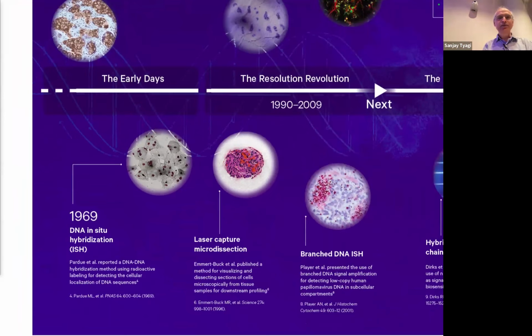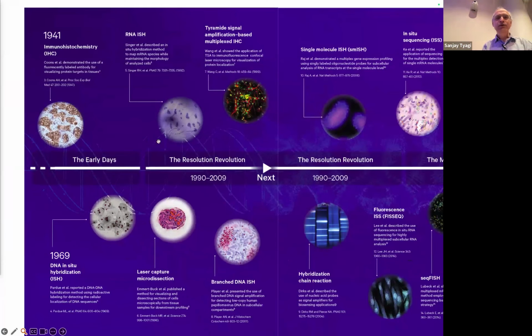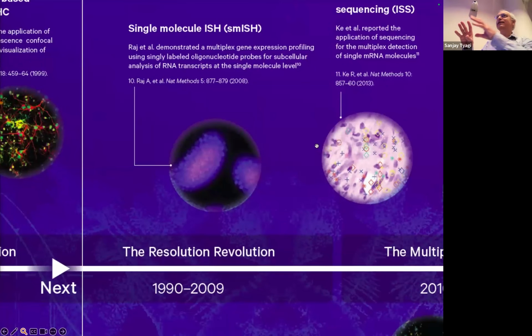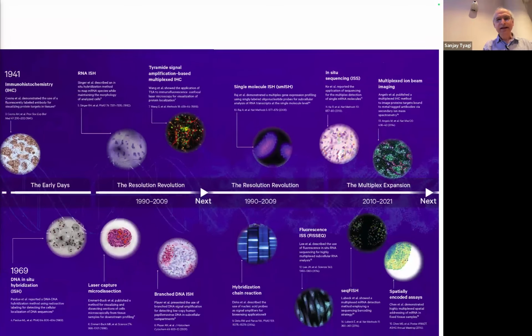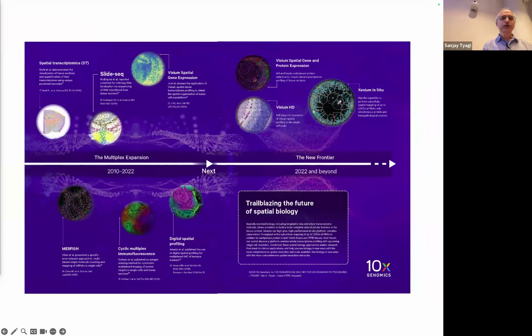And the second thing to point out is they were kind enough to cite Arjun's paper on single molecule FISH as being the foundational thing for this. So this is single molecule FISH, and now it has proliferated into all kinds of technologies, including 10x's own technology.